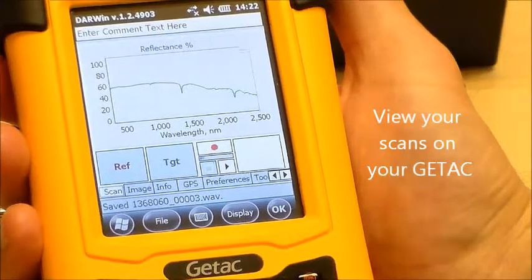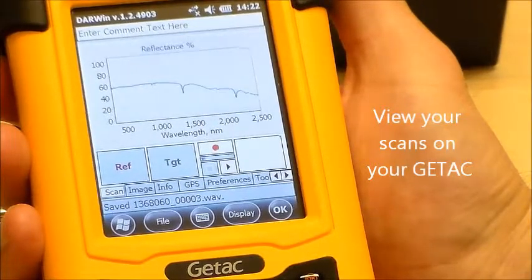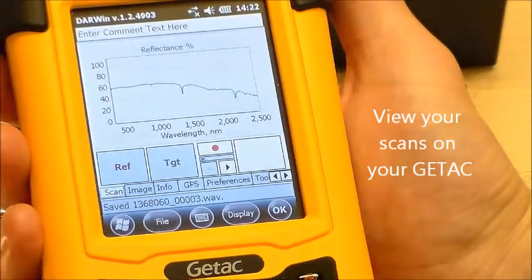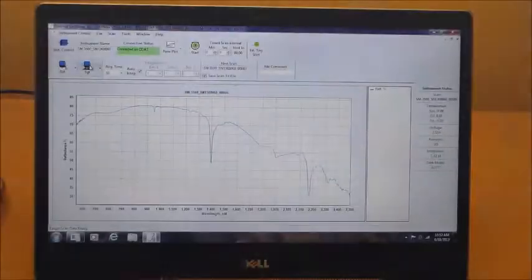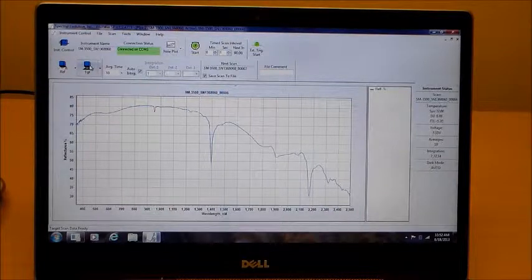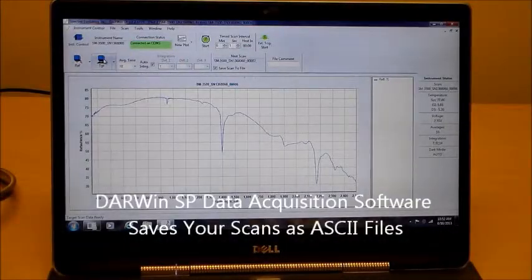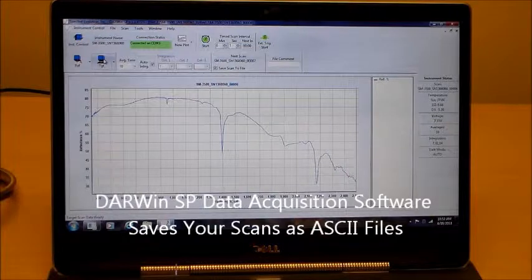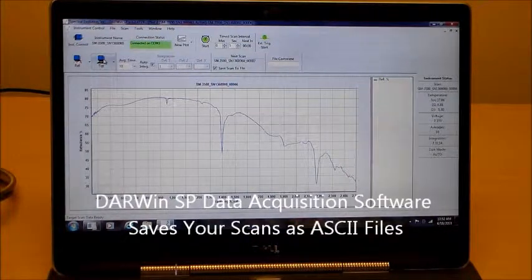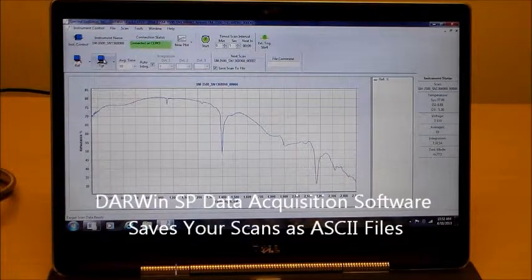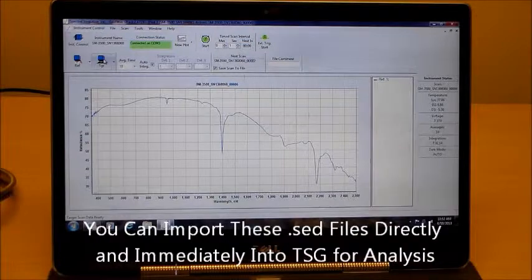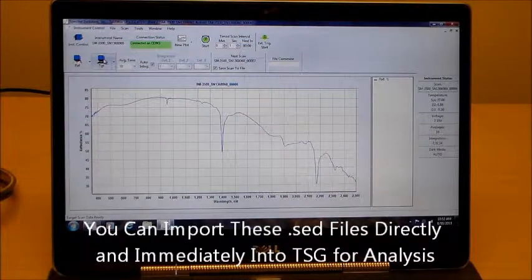You can view your spectra right on your GTAC microcomputer on location, or view them later on your laptop. Our Darwin SP data acquisition software is included on all our spectrometers and saves your spectra as ASCII files. These files are quickly and easily imported into an analysis program like the Spectral Geologist or TSG.